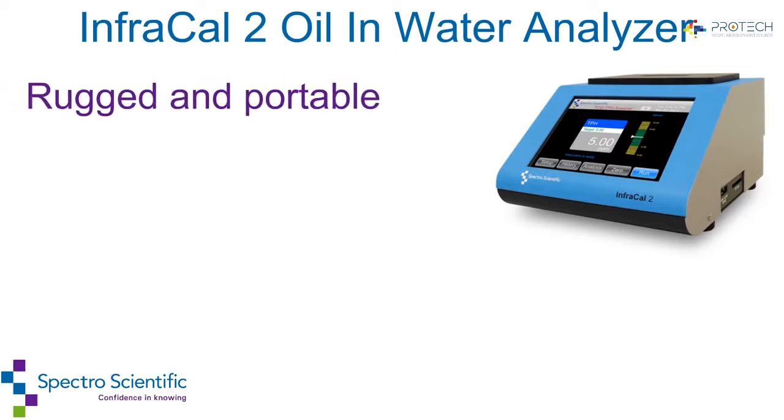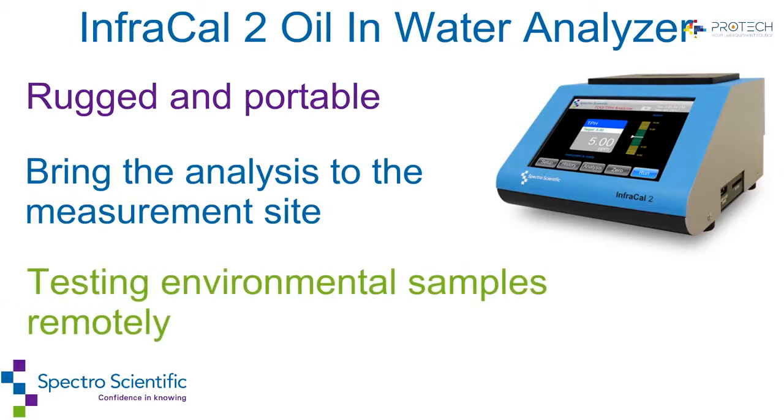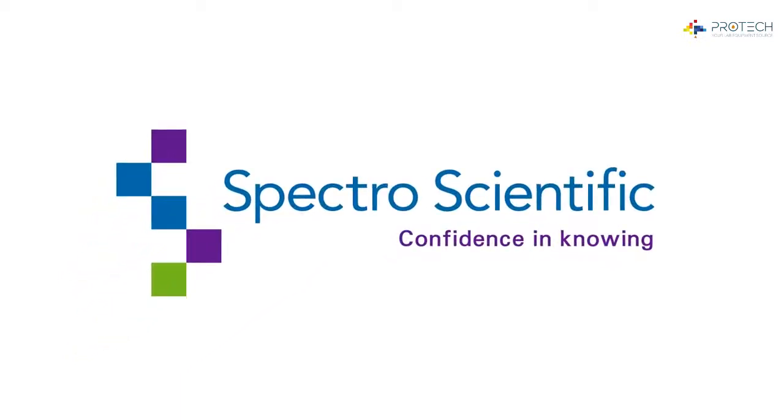The InfraCal 2 is rugged and portable, making it easy to bring the analysis to the measurement site or for testing environmental samples remotely. The InfraCal 2 from Spectro Scientific — confidence in knowing.